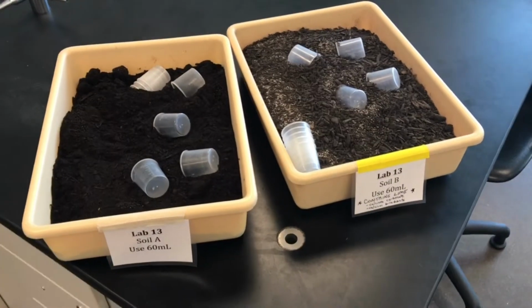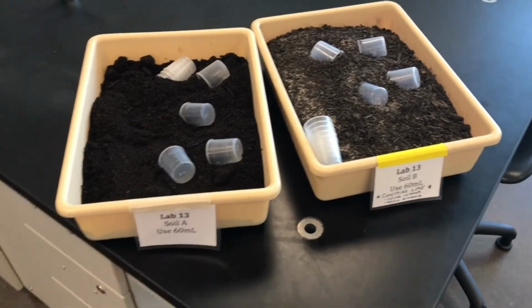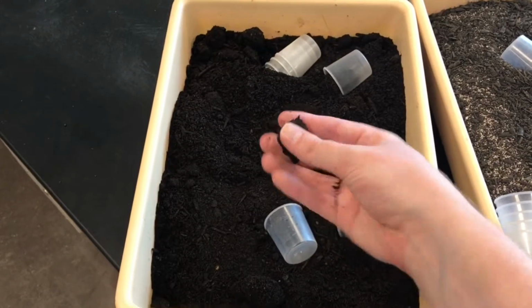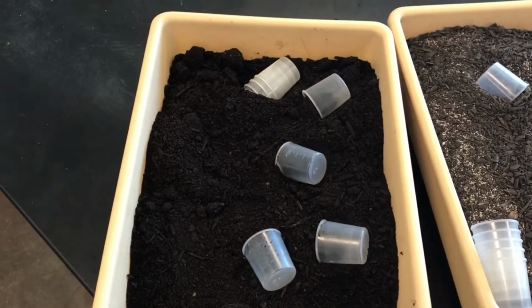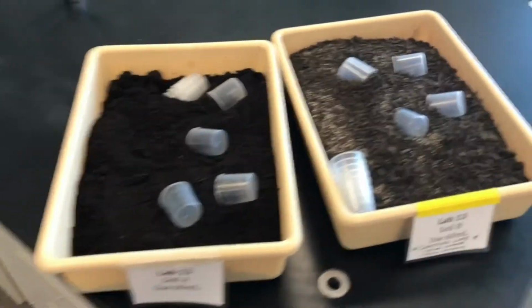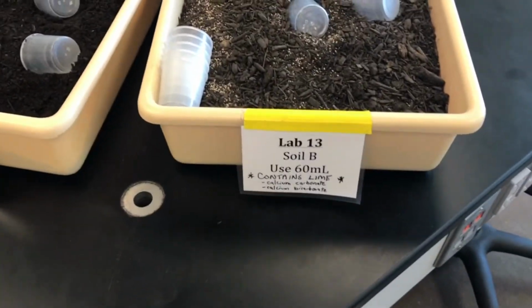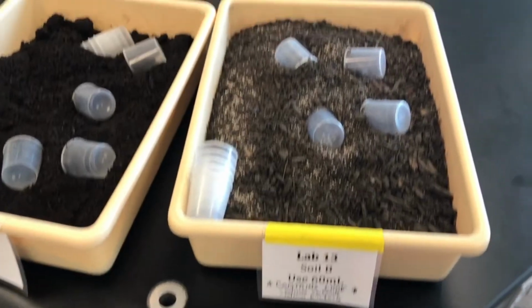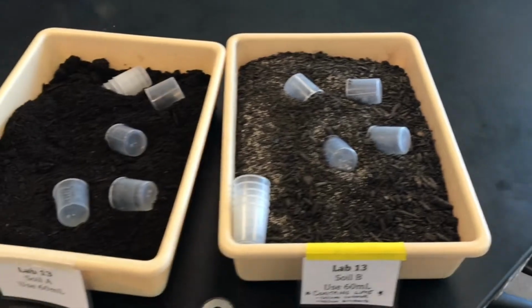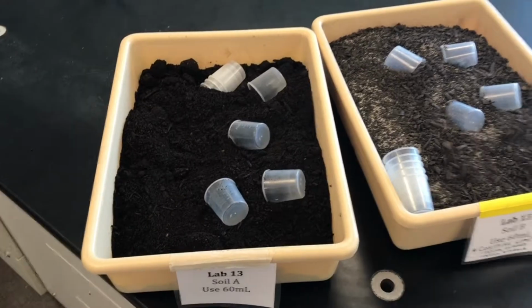So for this lab, we're gonna use 2 different types of soils. We're gonna run our sulfuric acid solution through both of these soils. So part 1 for this lab, we're gonna be using soil A, which is just basically normal soil, the normal soil that you would find pretty much anywhere, just organic material. The second soil is actually the same soil, but mixed in. We have calcium carbonate. So we have some lime solution, calcium carbonate. So this is going to act as our buffer. And so this will be for part 2. You're going to use soil B for part 2. For part 1 right now, we're going to use soil A.